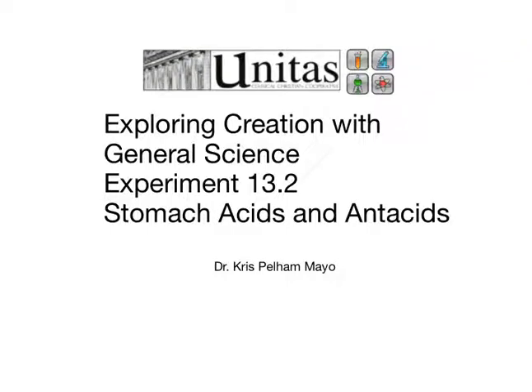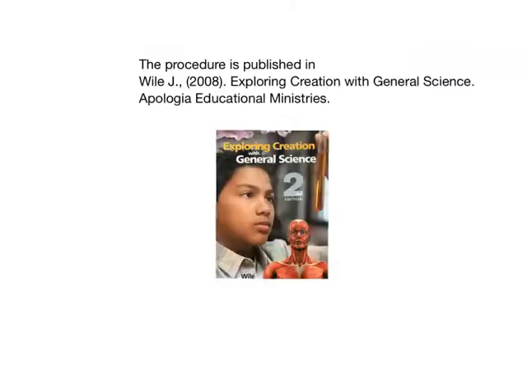Today we are doing the Exploring Creation with General Science Experiment 13.2, Stomach Acids and Antacids. The procedure for this experiment is published in Exploring Creation with General Science by Wile and published by Apologia Educational Ministries. The purpose of this experiment is to gain understanding of the properties of stomach acid as well as the function of antacids.